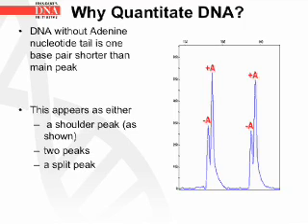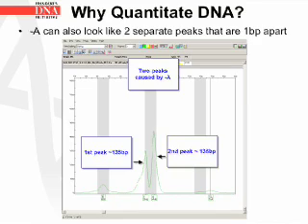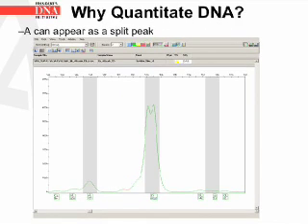DNA without the adenine nucleotide tail is one base pair shorter than the main peak and is referred to as minus A because it is lacking the A nucleotide. This can appear as either a shoulder peak as shown in the diagram, two separate peaks, or a split peak. Here we have a diagram where the minus A is causing there to be two separate peaks — notice that both peaks are only one base pair apart. Minus A can also appear as a split peak, where the top of the peak instead of having one point will have two points.